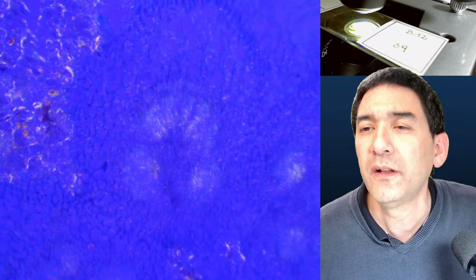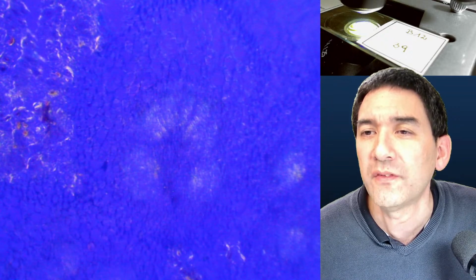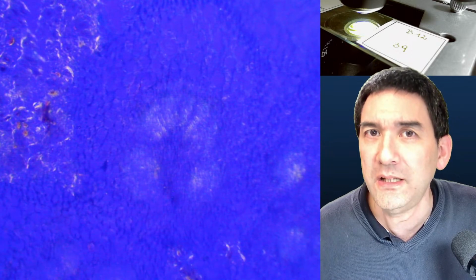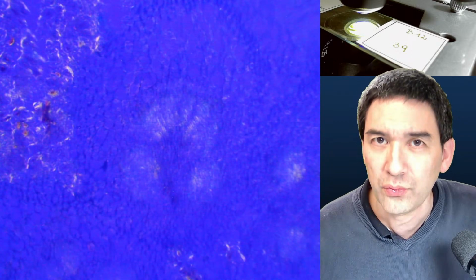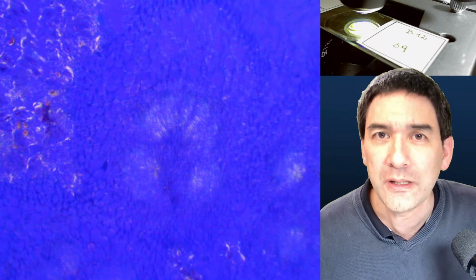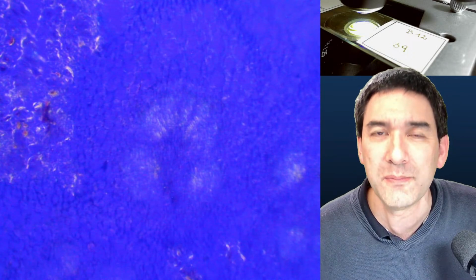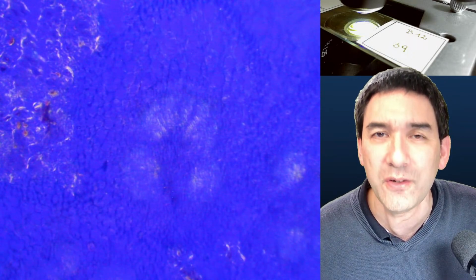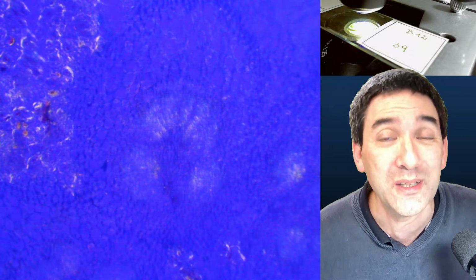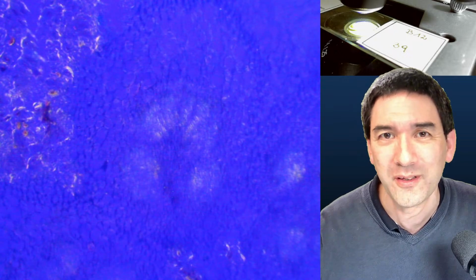So if these filters remove the need for stains, would this allow you to see a nucleus of a cell instead of methylene blue? Possibly not. The reason is because when you use methylene blue, you're actually chemically staining DNA. So methylene blue is quite specific and stains DNA very well, while this optical staining does not look so much at the chemical composition, but more at how the specimen interacts with the light.